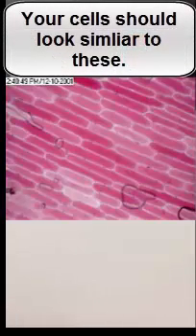So that's how you set up your wet mount slide and draw your solutions underneath the cover slip for the purposes of the lab.